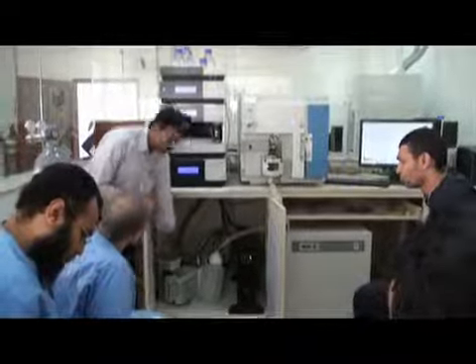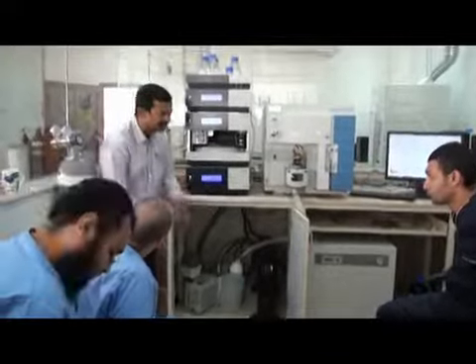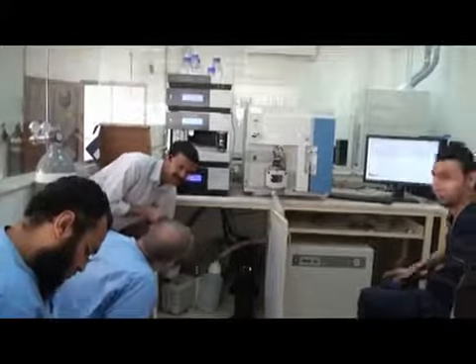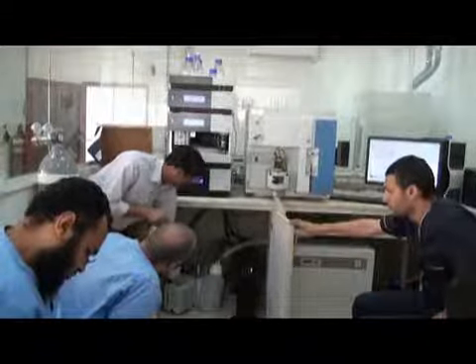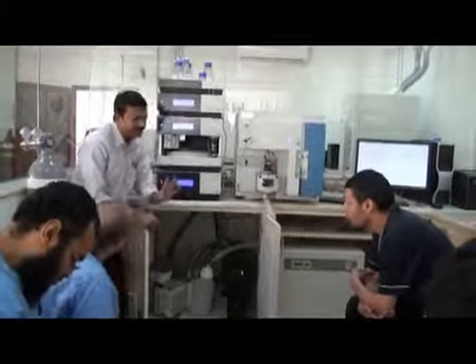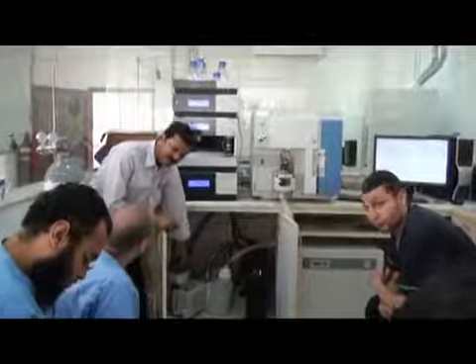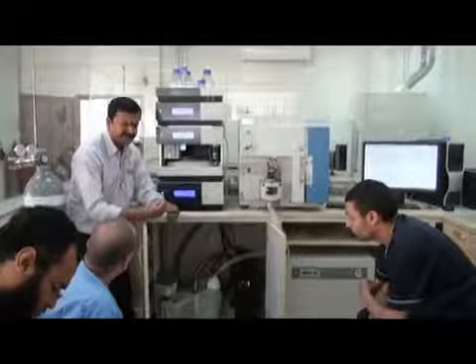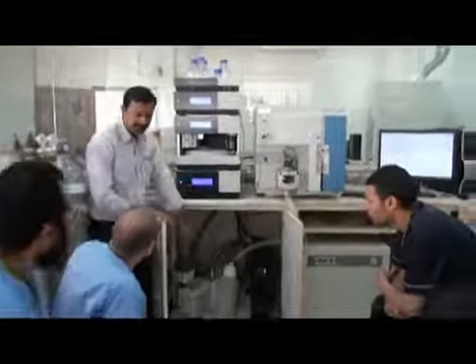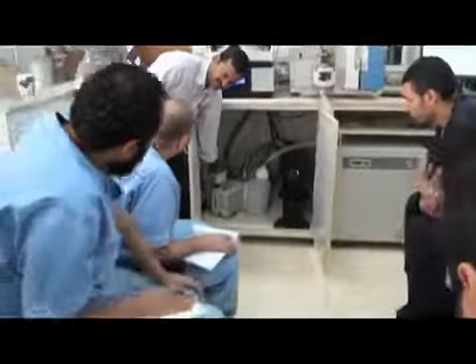This is a pump. After every 1 week, I'm telling you the maintenance also. After 1 week, check the level. If the level is coming higher here, just open this valve for 5 to 10 minutes. This is called the ballast. Make it a routine: every Sunday morning, come, open it for 10 minutes and then close. The oil present here will go inside the pump. Now see, a little oil is here.